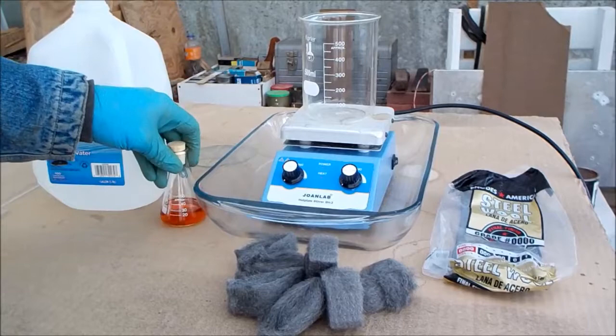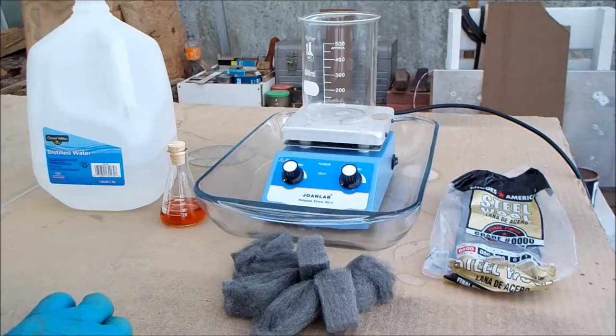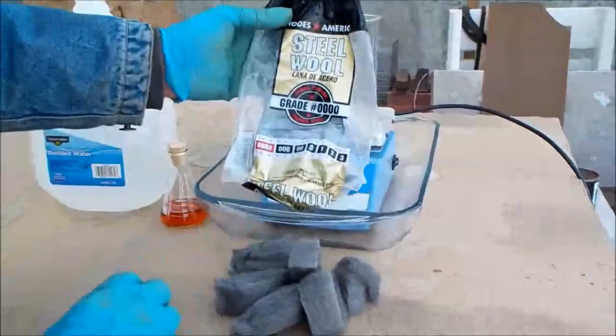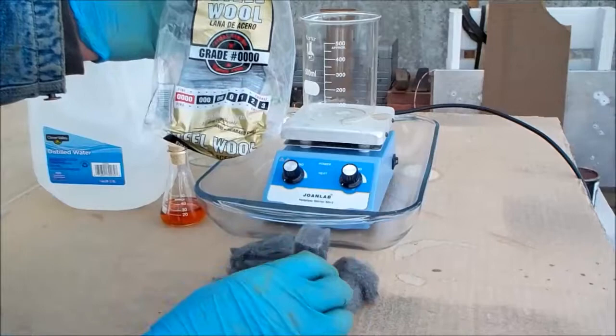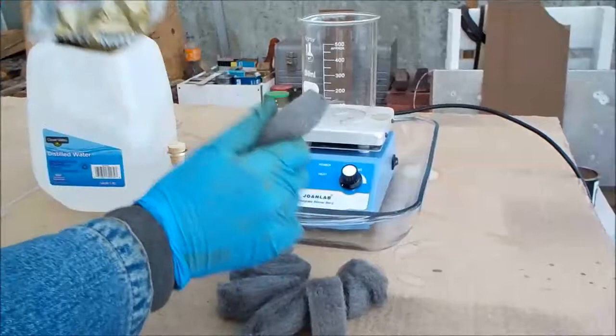And I weighed my steel wool, and I had 22.1 grams of steel wool. This is 0000 grade steel wool, which means it's pretty fine. And it doesn't have anything added to it. It's just steel wool, no cleanser or grease on it or anything.